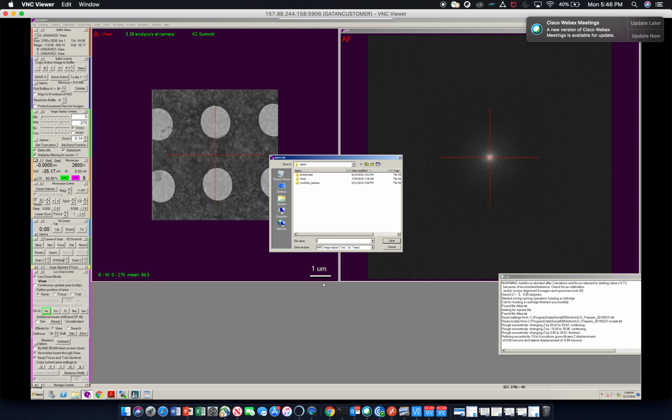We'll say OK again, and now we need to give this a folder, and this is being collected under the Radex folder. And then let's see, it's going to be under Bornea here, and we need to create a new file with this name.